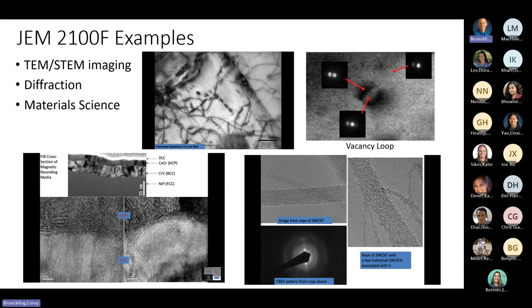Here's just some typical examples. The top thing is actually aluminum that I pulled in tension, broke, and we see these little loops. See these punched out loops here? Those are vacancies. When dislocations intersect, they create vacancies. These vacancies coalesce and create these loops. Here was an interesting example of just punched out loops from a bunch of dislocations.